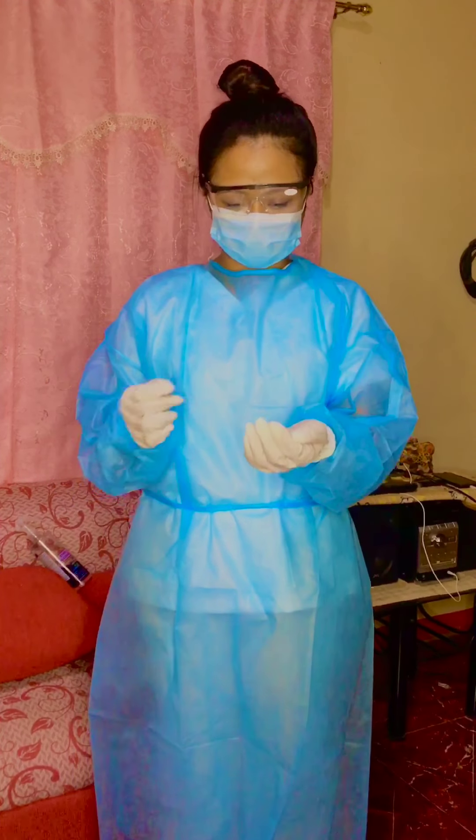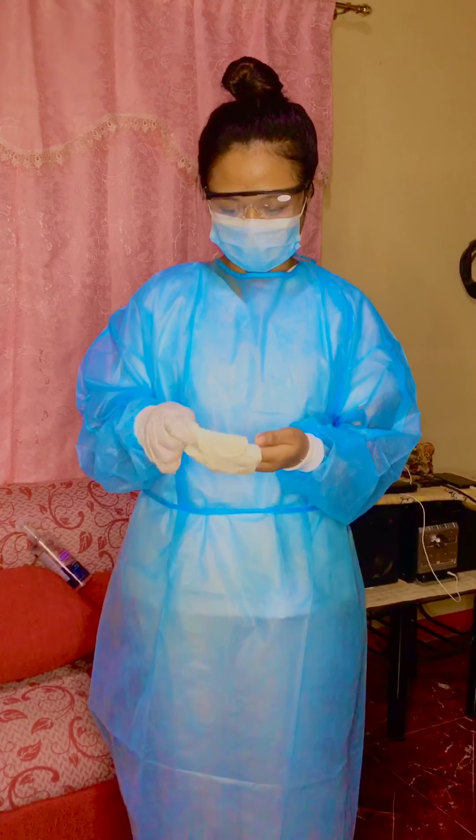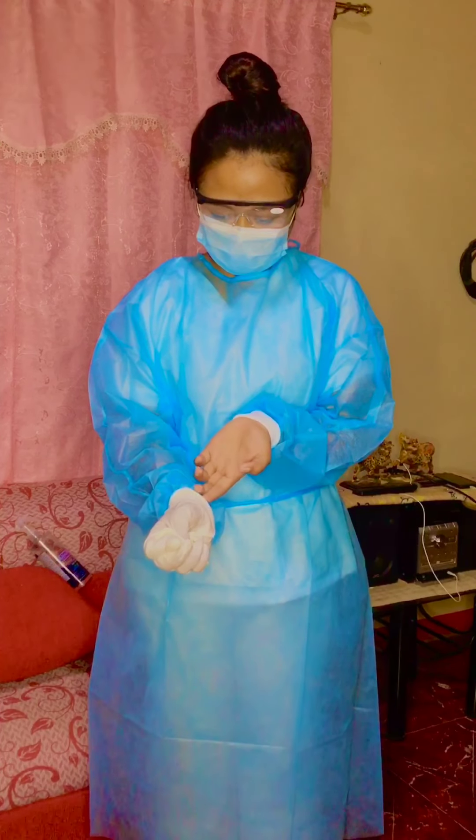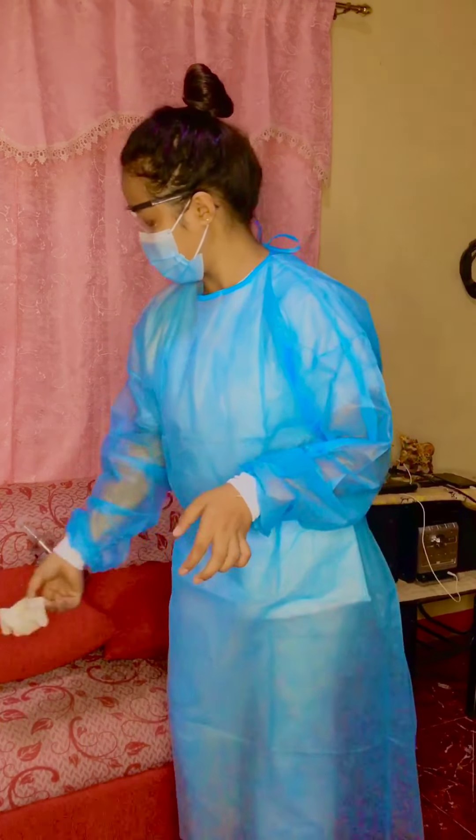Now we're going to proceed in removing the PPE: gown, gloves, mask, and eyewear. So first, pinch the outside of the glove at the wrist. Peel downwards, pulling the glove inside out. With your ungloved hand, slide your finger under the wrist of your remaining glove. Again, peel downwards, turning the glove inside out. Discard the gloves.